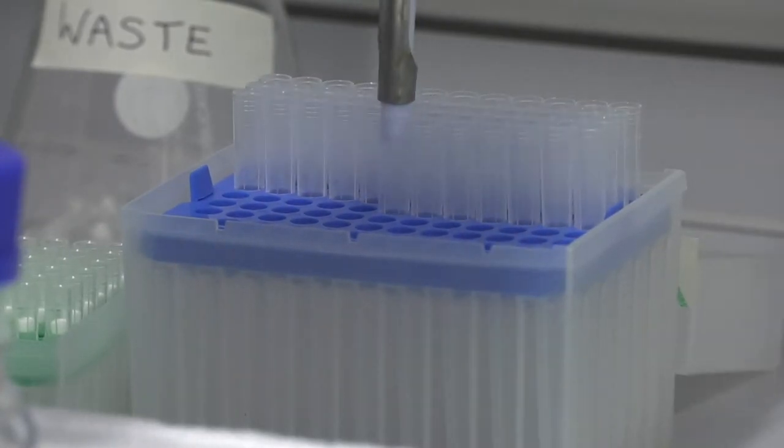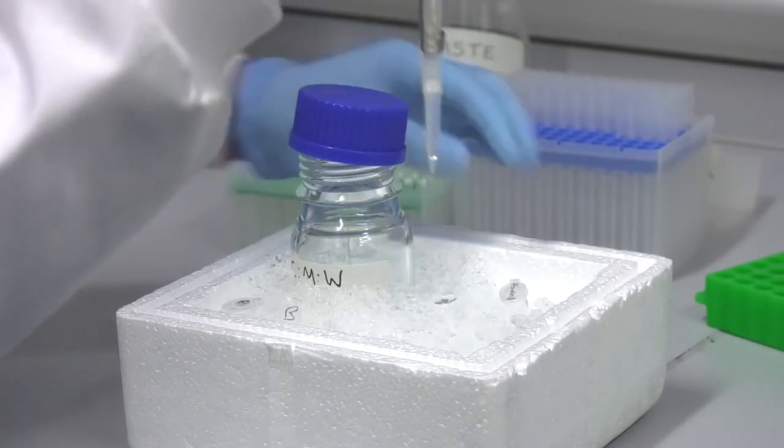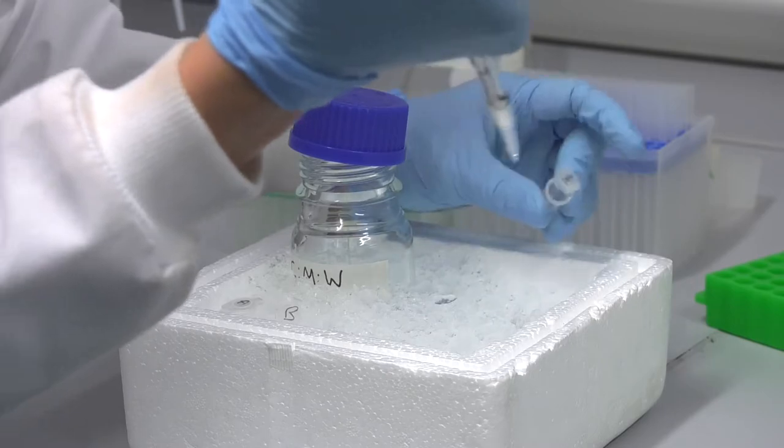Step 3. Add 1 milliliter of extraction solvent to your samples. For the pooled sample, add solvent in a 1 to 40 ratio.